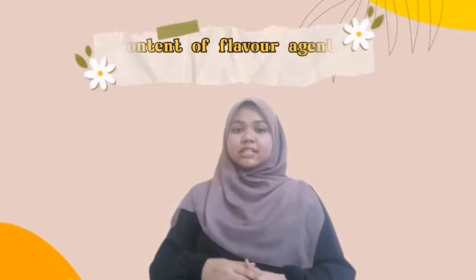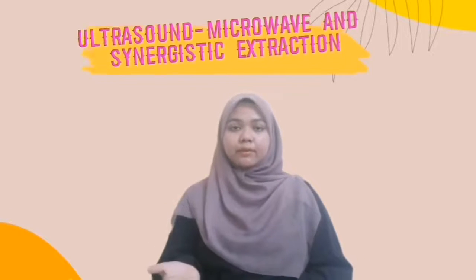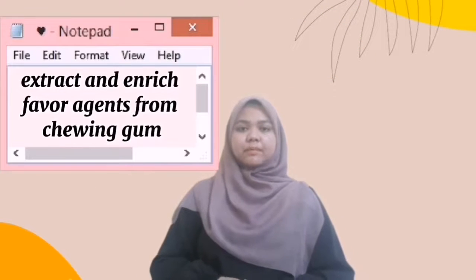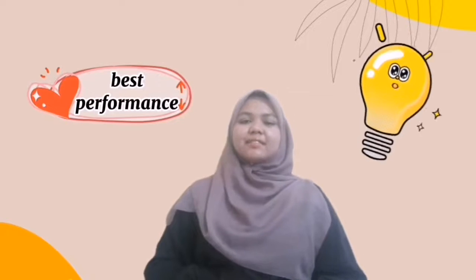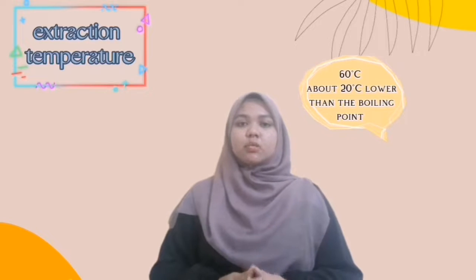Since the content of flavor agents in chewing gum is low, the extraction and enrichment of these trace flavor agents are a crucial step before the selective and sensitive detection. Here, an effective technique to extract targets from food samples is ultrasound microwave synergistic extraction. It is used to extract and enrich flavor agents from chewing gum. In order to obtain the best performance of the extraction and enrichment, several extraction conditions were optimized by rationally designed orthogonal tests. The extraction temperature was set at 60 degrees Celsius, which was about 20 degrees Celsius lower than the boiling point of each solvent in order to prevent violent boiling.